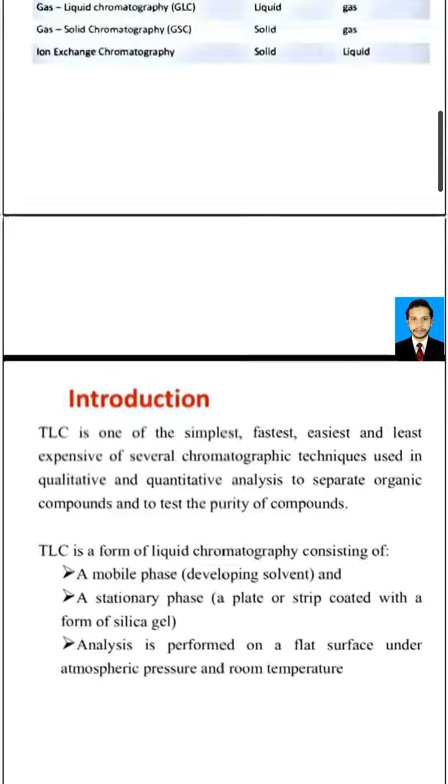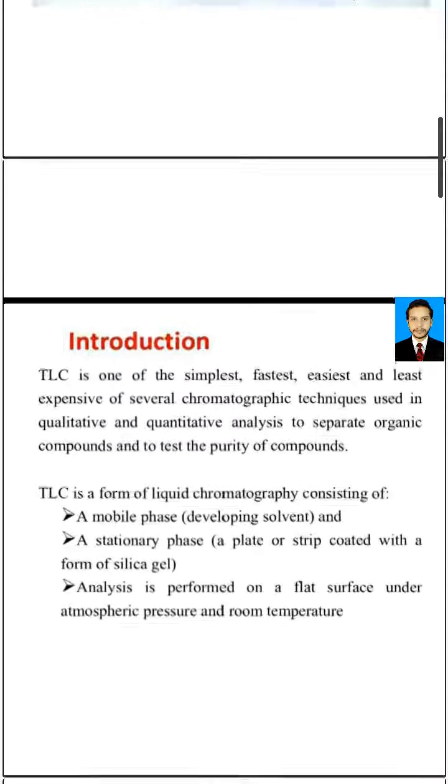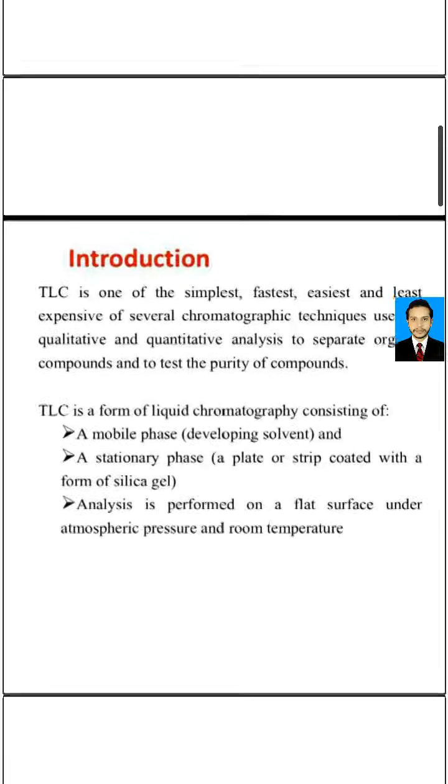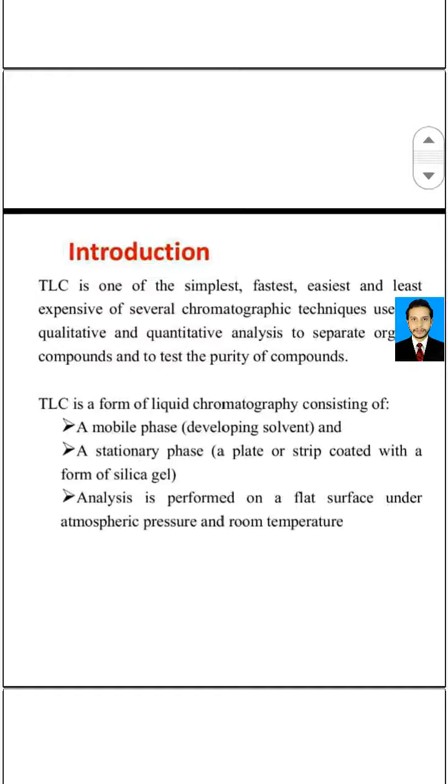Now let us talk about the introduction. TLC is one of the simplest, fastest, easiest and least expensive of several chromatographic techniques used in the qualitative as well as quantitative analysis, to separate organic compounds and to test the purity of compounds. TLC is a form of liquid chromatography consisting of a mobile phase and a stationary phase, a plate or strip coated with a form of silica.